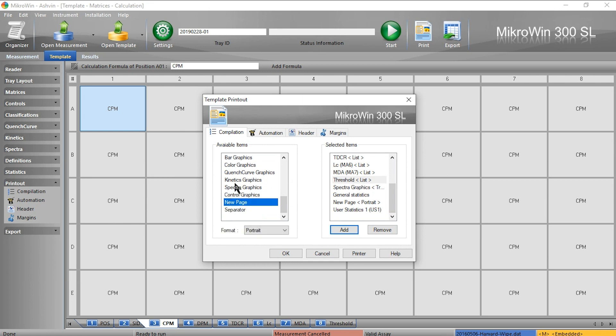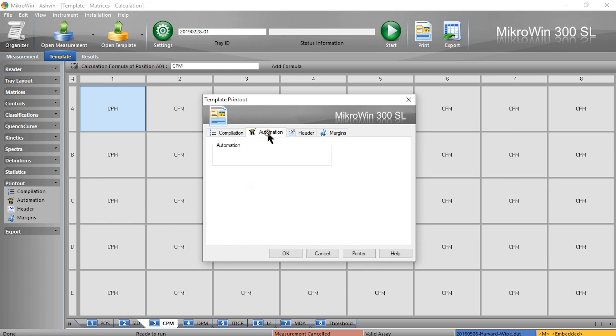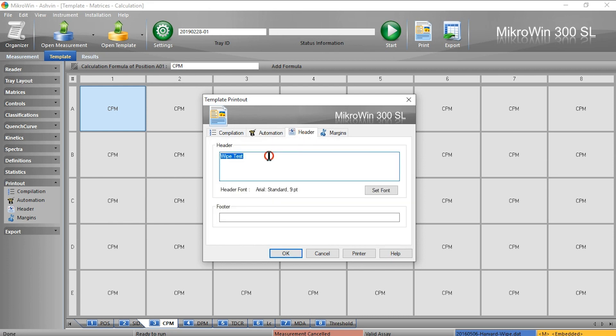In automation I can select automatic printout. In header I can give custom headers and even a footer.